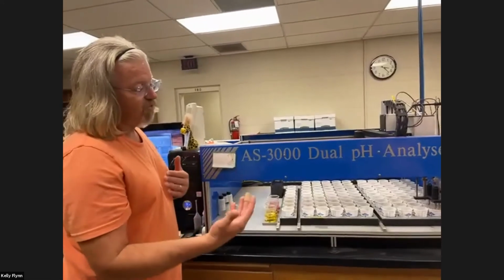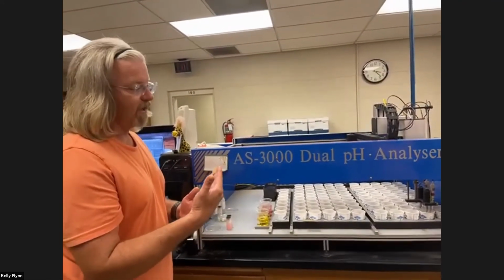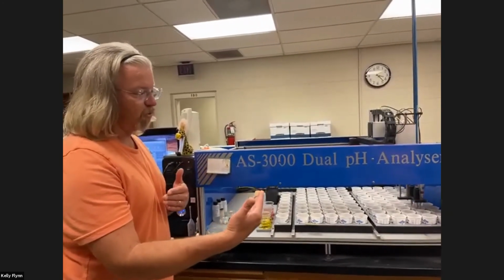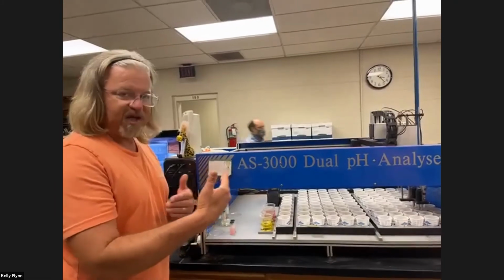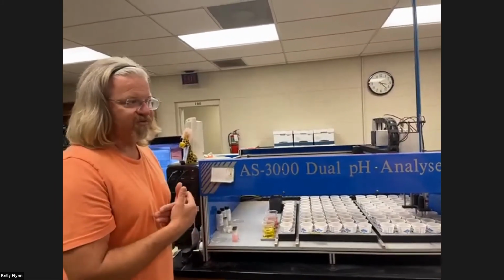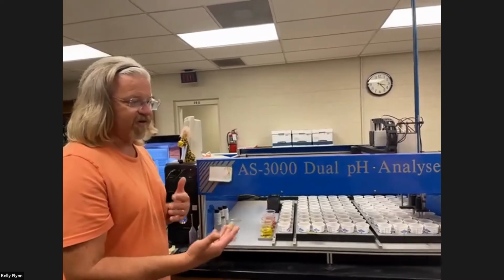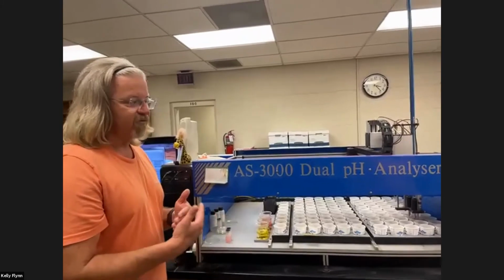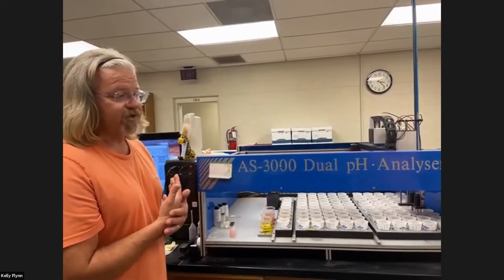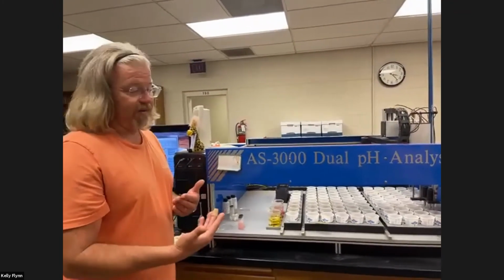And so what we're doing is we have formulas here in the lab that will then tell us automatically how much lime you need to add to a particular soil at a given pH to change its pH. So as you know, most stuff grows between 6 and 7 or 6 and 6.5. We encounter a lot of soils here in South Carolina that are 4.5 to 5. So lime is going to be needed. We do encounter some from the lower part of the state, Charleston and other areas, where they already come in at 7. So they won't need anything.